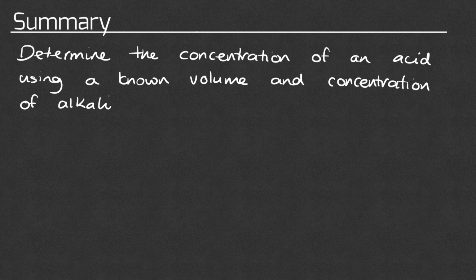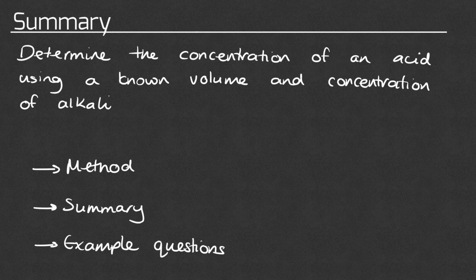This video covers required practical 2, which asks you to determine the concentration of an acid using a known volume and concentration of an alkali. We'll look at the method for the practical, a summary of the method, which you could write if you were answering an exam question, and then look at some example data and the calculations you would do with the results of your practical.